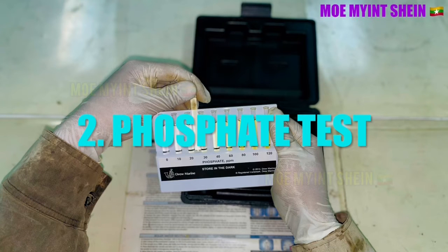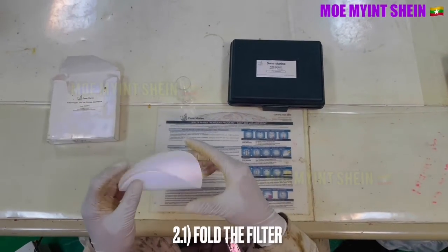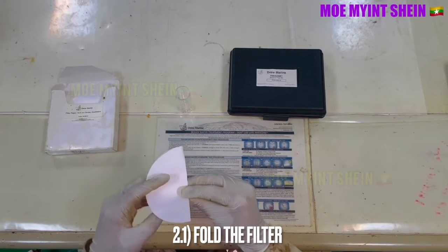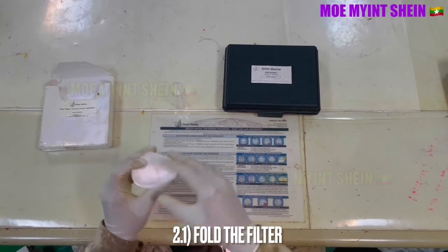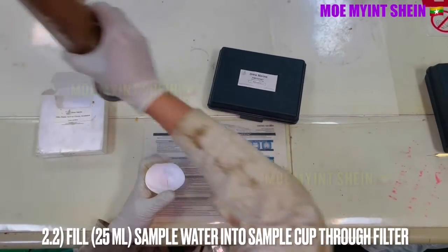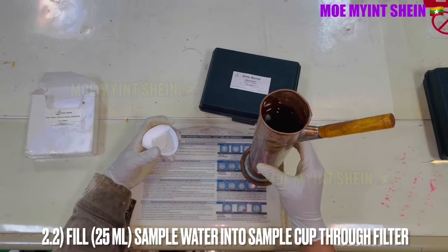As the second test, we will carry out the phosphate test. Fold the paper filter like this. Fill 25 ml of sample water into the sample cup through the filter.